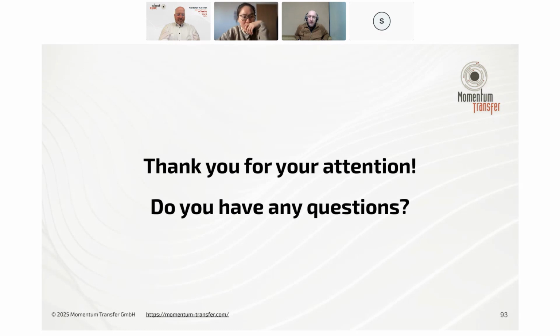But I know Xiaoke Mu and, as you said, Kübel, and there are a few other people doing quite extensive work on electron PDF mapping. Simon has also done quite a bit of work there. So I think you can look to those papers to see what people are saying. Yes, so there are two resolutions in terms of the information you get in the PDF map or the PDF data, and one is limited by the probe size or the volume of the sample that you are sampling. So these are two factors.